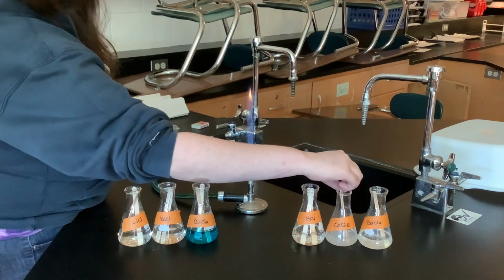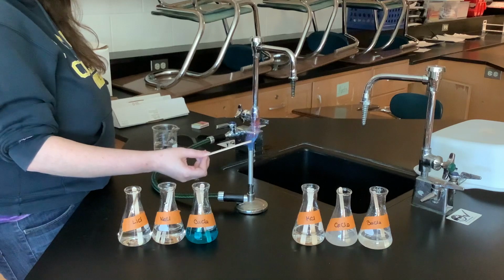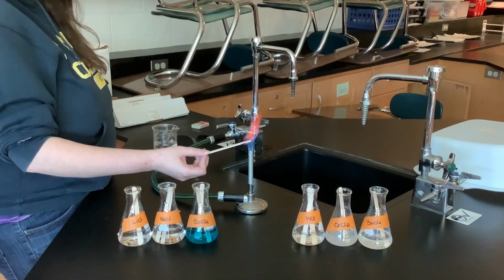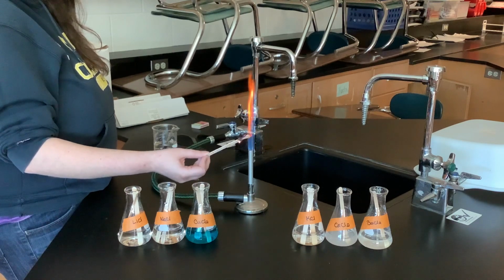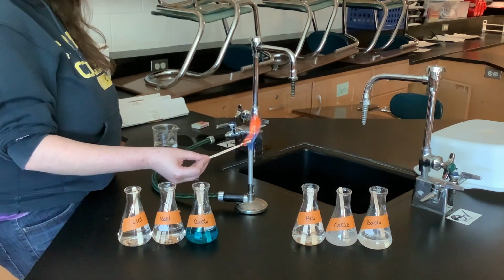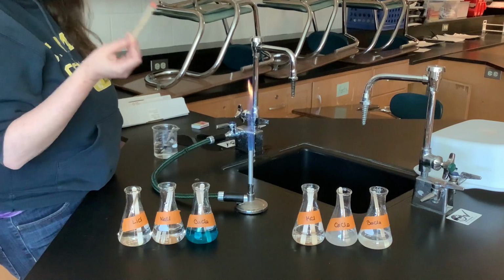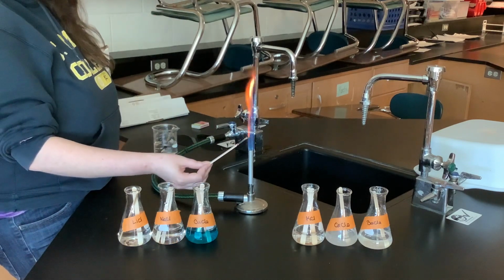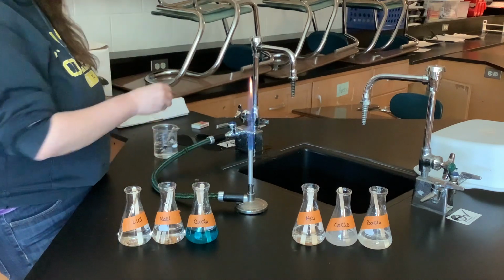We're gonna do calcium next. If you see those little orange flecks that look like normal fire, that is normal fire from the stick. We're looking for those other colors, like that darker orange, for example.